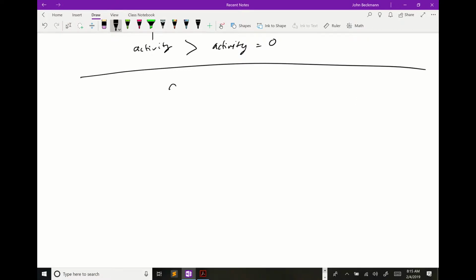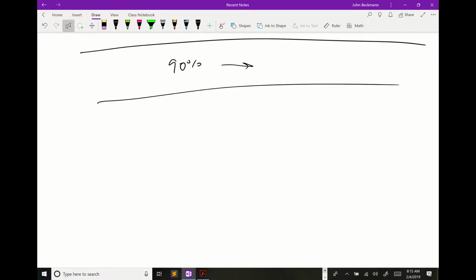Again, I've said this before, 90% of your work in molecular biology is building reagents. So you don't just have a negative control all the time. You actually have to build your negative control. So this is a protocol by which you can do that. Okay, so I'm just going to briefly walk through what happens, and then I'm going to walk through how you would design the primers and lay it out for you.